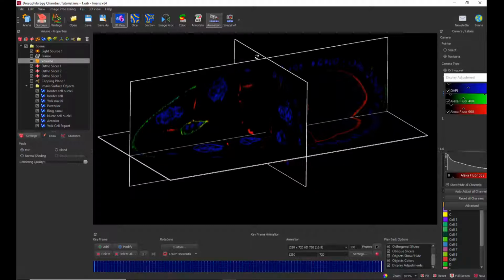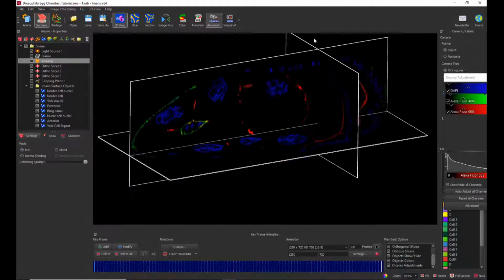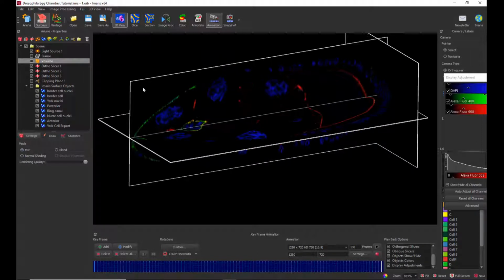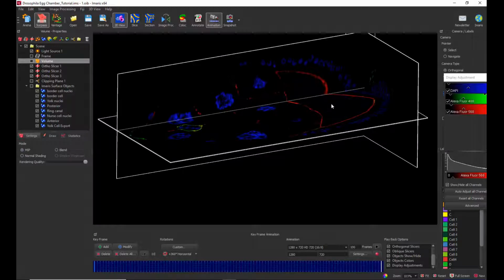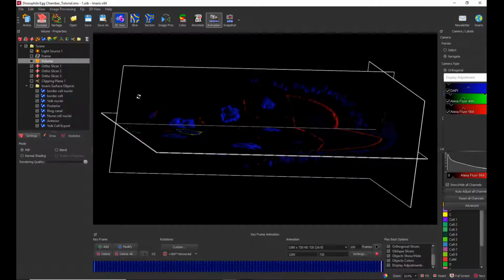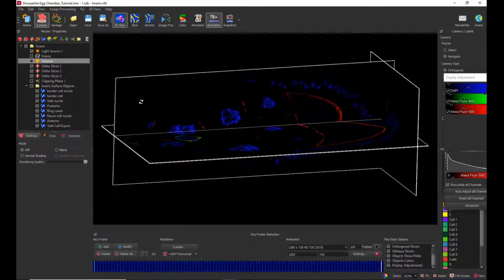So what happens next in the movie? The ortho slicers move towards the end. This one goes towards the middle, and this is more here, and the scene is rotated like this. So I set up the frame and add a keyframe. And have a look at this slider, it will be added in the end. Right, so that's my new keyframe, and that's the previous one.